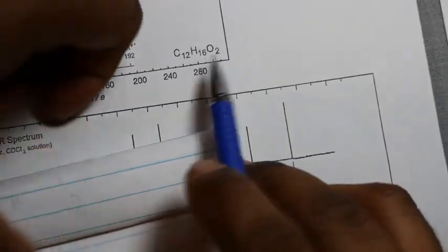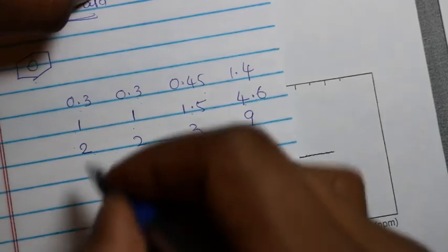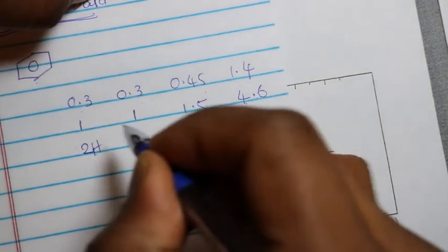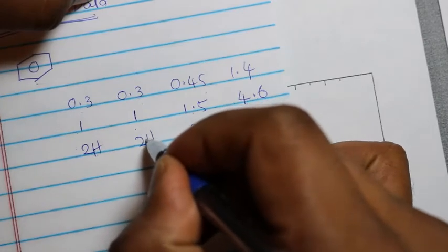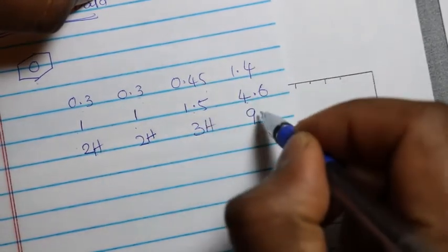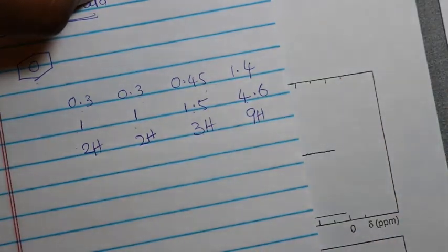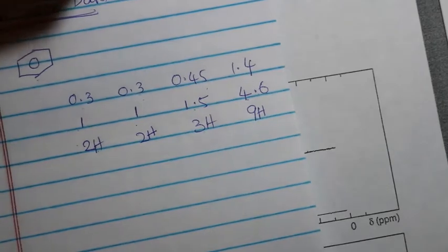So from the molecular formula we have 16 hydrogens. So the first peak has 2 hydrogens, the second peak has 2 hydrogens, the third peak has 3 hydrogens, and the fourth peak has 9 hydrogens. This is how you can find the number of hydrogens for each peak.